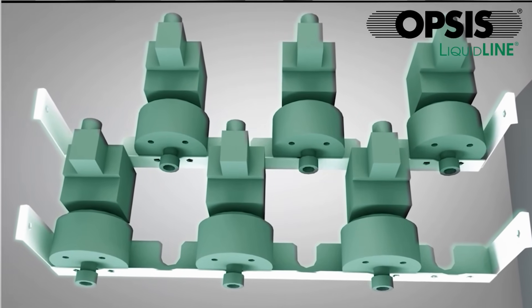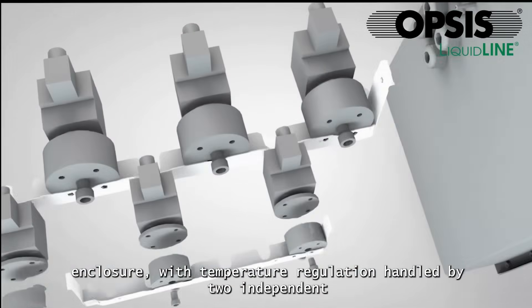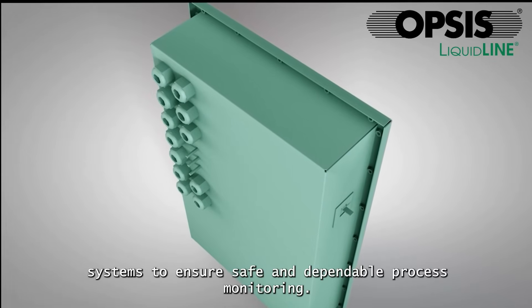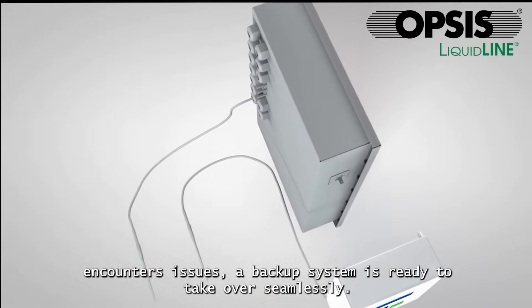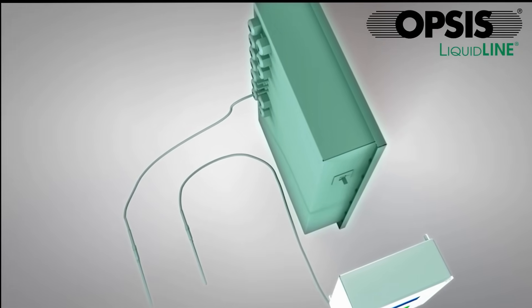Third, the electronics are contained within a separate sealed enclosure, with temperature regulation handled by two independent systems to ensure safe and dependable process monitoring. This dual-system design ensures that if a probe fails or the software encounters issues, a backup system is ready to take over seamlessly.